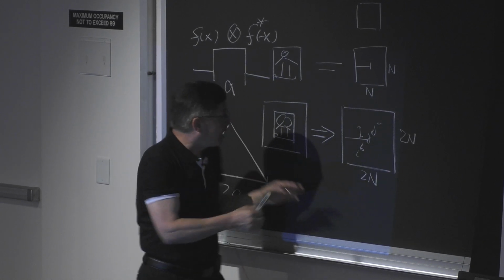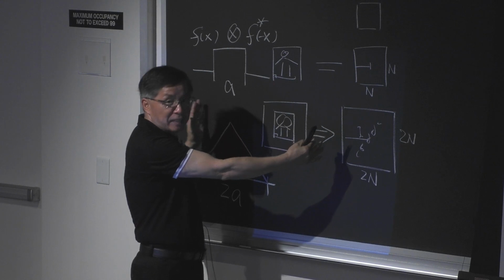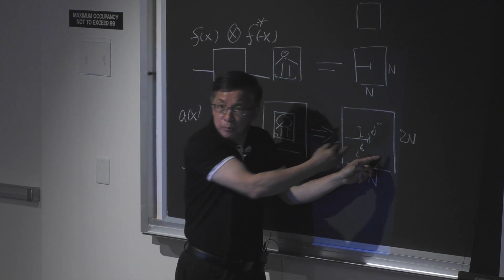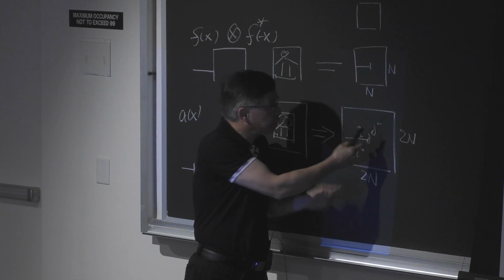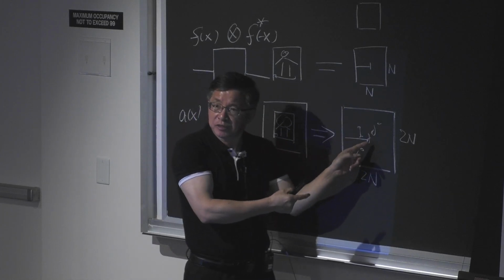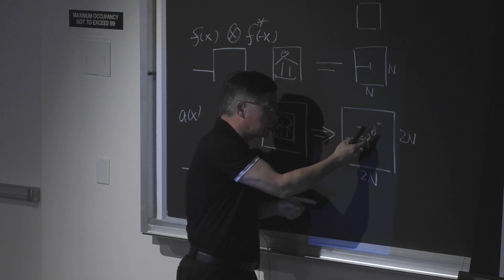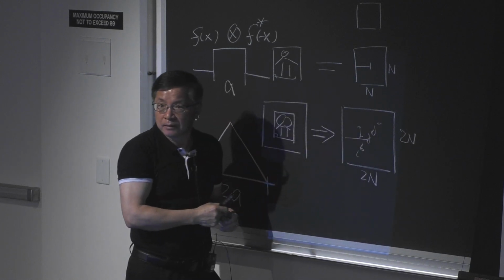So here, you just pad. In math, you can pad zeros. You can pad infinite zeros, but here you have to measure it. For the experiment, you have to measure it. Without measuring finely, if you use 1 pixel, there's nothing. You have to sample sufficiently. You can oversample. You sample the Fourier space finely, then you can get this.